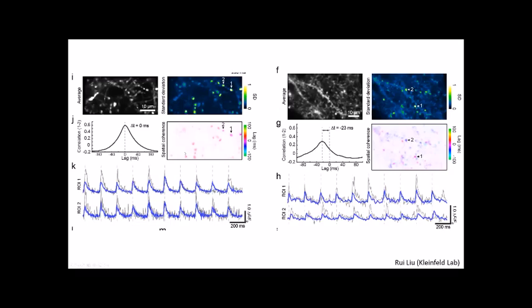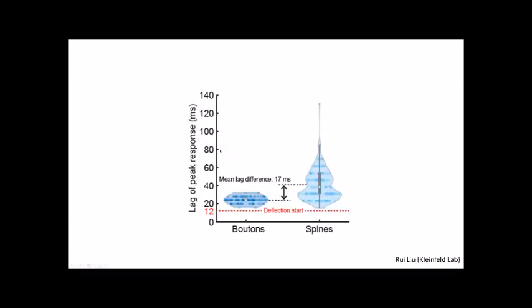Because when imaging these axons, of course, all the other axons that create this heterogeneous dendritic response are in the same volume, but we don't see them at all on any of the labeled axons. And so that really tells us that we have an indicator that has high specificity to the synapses of the structures that we're labeling. And again, the distribution of timing lags is very, very tight for axons, and it's heterogeneous with a spread of tens of milliseconds for spines.